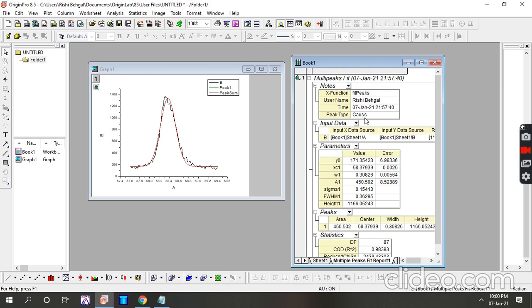In my previous video on Origin, I showed you how to plot a graph of FTIR or XRD. But in this video, we have just seen how to calculate the full width half maxima, and this is also known as deconvolution of a peak.